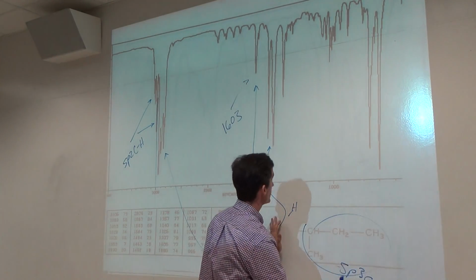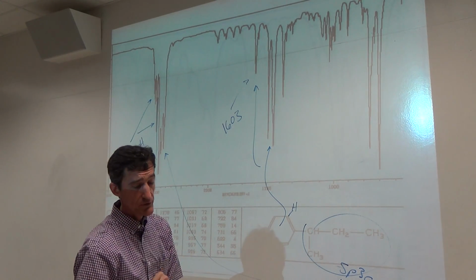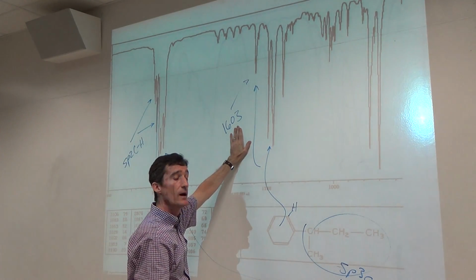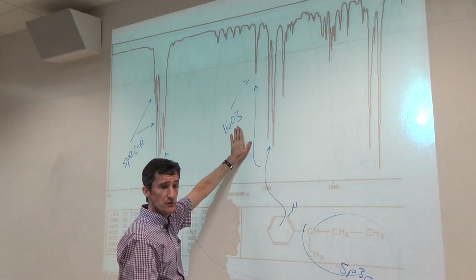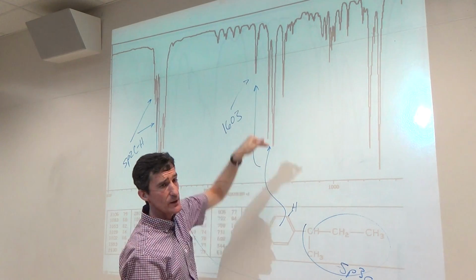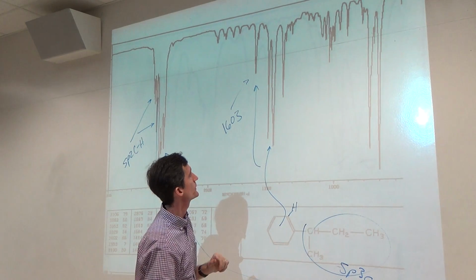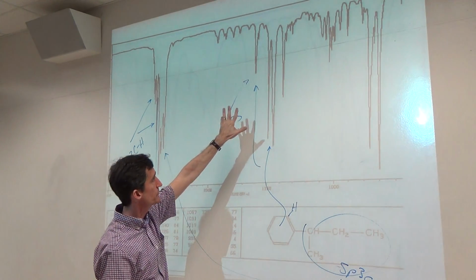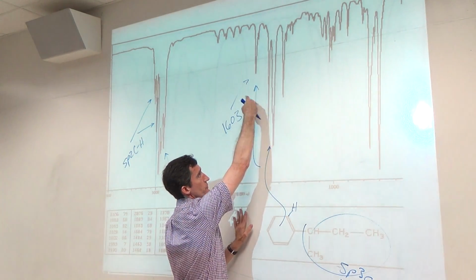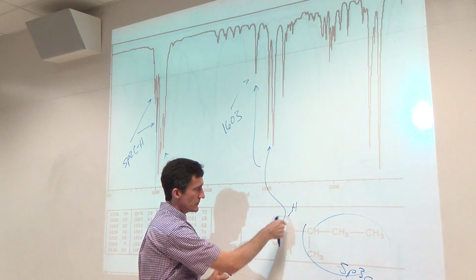Obviously, there's no carbonyl here. But what if you didn't have the structure? You may think, well, carbonyl. There's 2 reasons why that is not apparently a carbonyl. First off, 1603 is a bit too low. The lowest you'll see is probably about 1625 to 30 for your amides. It's also too weak. Carbonyls tend to be more intense, like these guys. That's probably part of the aromatic, which gives a couple of 2-3 peaks in here for the bending here, maybe the individual carbon-carbon double bonds.